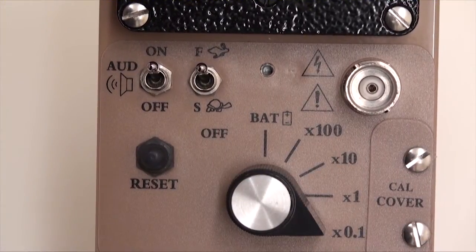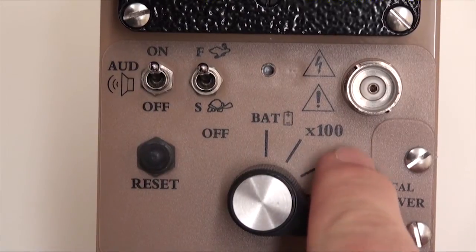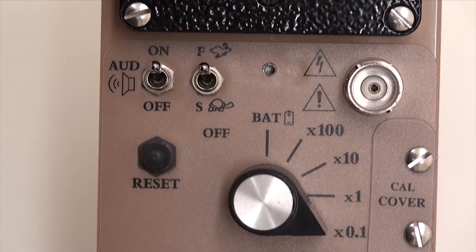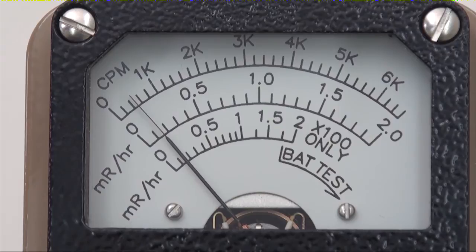The Model 3 supports four decades beginning with the x0.1, x1, x10, and x100 scales. The instrument reading is calculated by simply multiplying the value setting of the rotary switch by the value indicated by the needle on the analog scale.